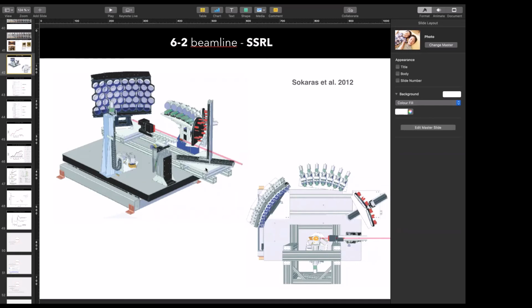Is that because of extra absorption of the X-rays, or because of overlapping edges? Because of the absorption. If you have a heavy element that absorbs the X-rays, you will not be able to detect the X-rays scattered off the sample due to the X-ray Raman scattering process. They will not be able to escape the sample and be detected.